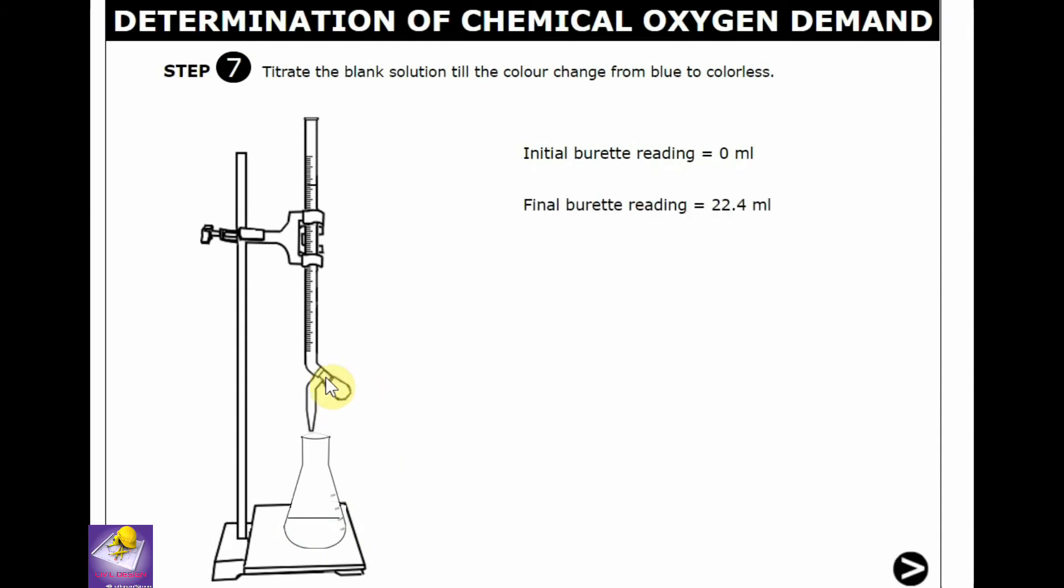When the solution turns to colorless, then we stop the titration and take the reading: 22.4 ml.